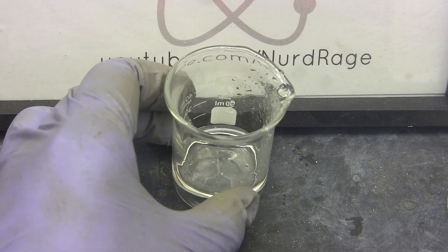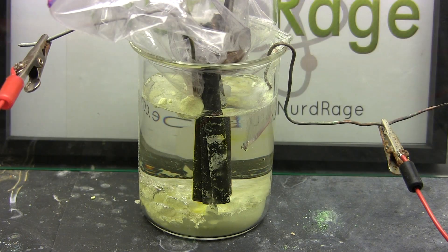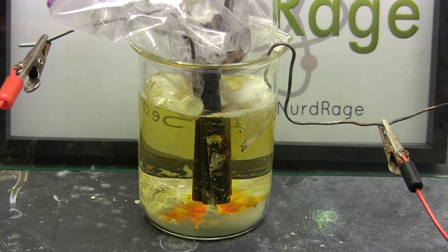Greetings foul nerds. In this video we're going to make sulfuric acid from sulfur and water using a new process I found that I'm calling the electrobromine process.